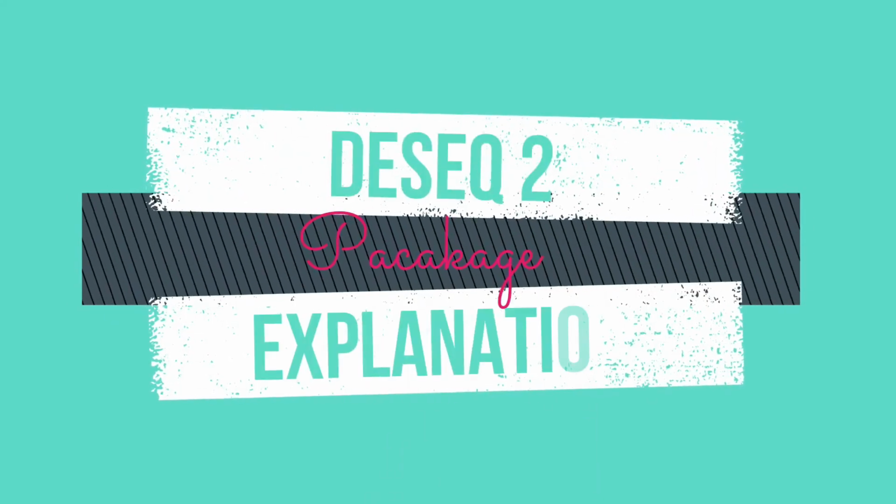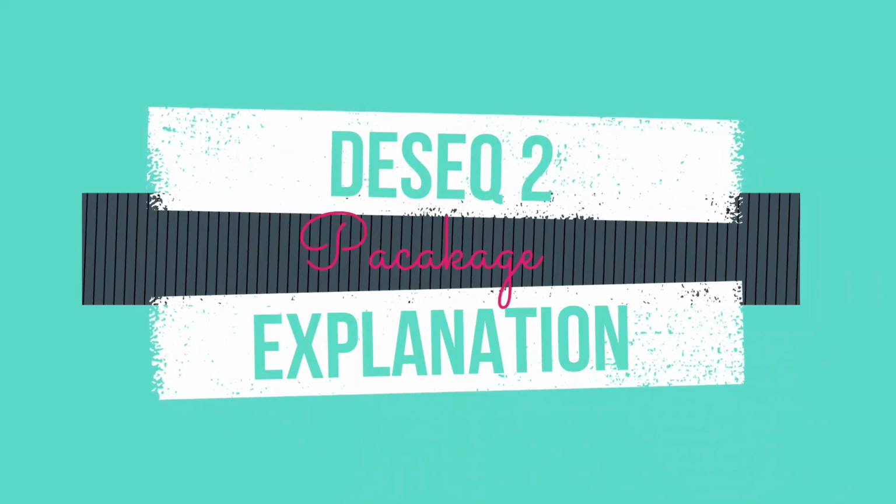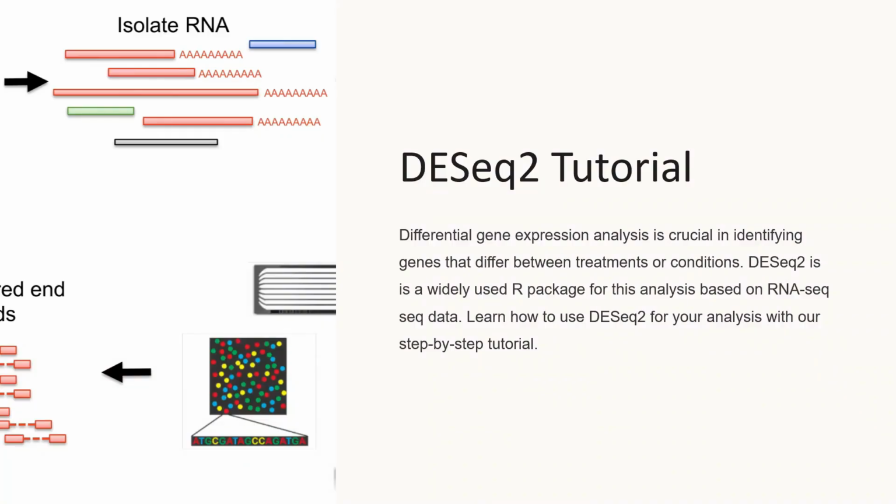So let's talk about RNA sequencing or differential gene expression. Differential gene expression analysis is crucial in identifying genes that differ between your treatment and condition analysis. So what is differential gene expression, and where can we get the differential gene expression data?